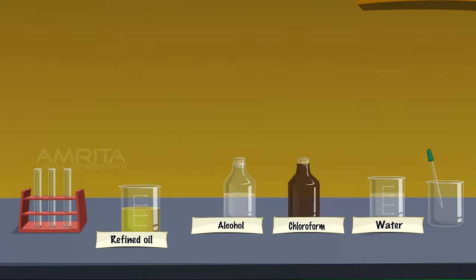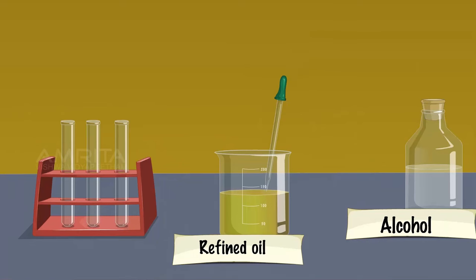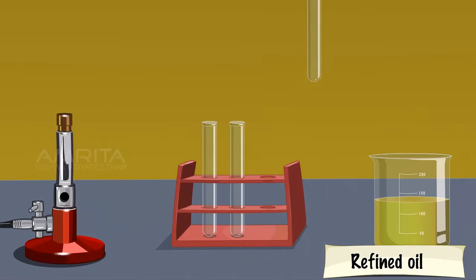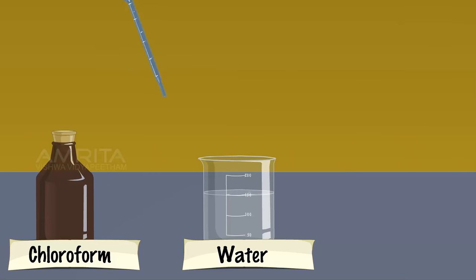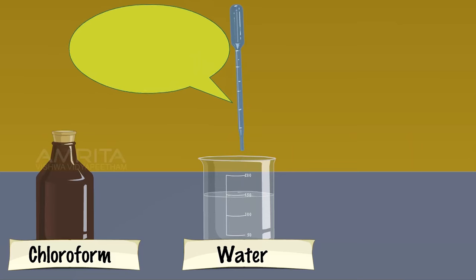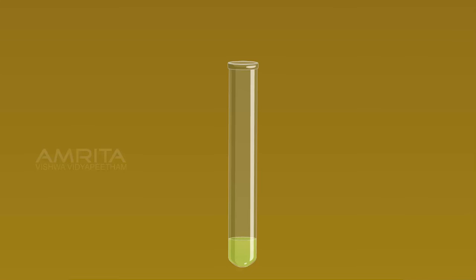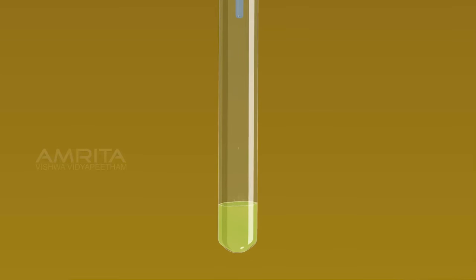Refined Oil. Using a dropper, take a small quantity of refined oil in a test tube. Using another dropper, take about 5 ml of water and add it into the test tube containing refined oil. Oil is immiscible, i.e., not mixable in water.